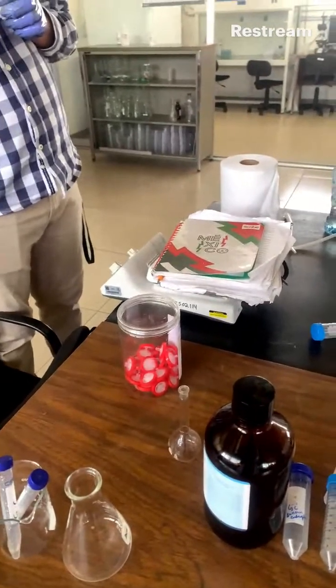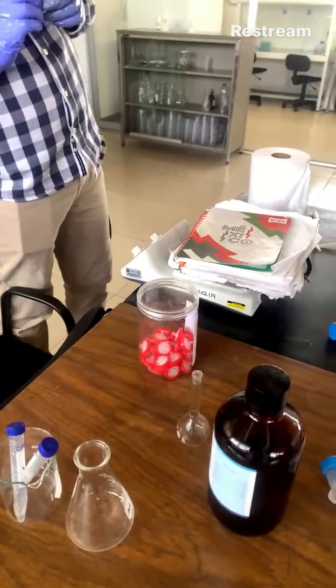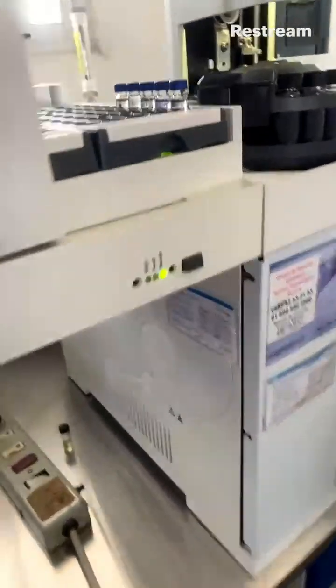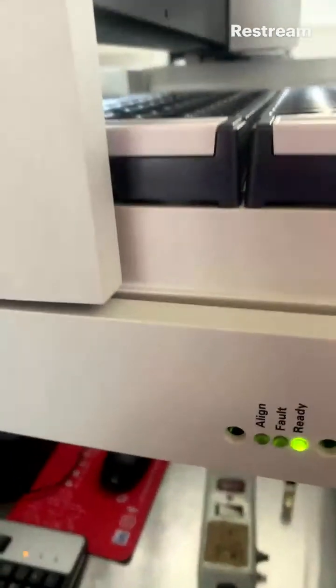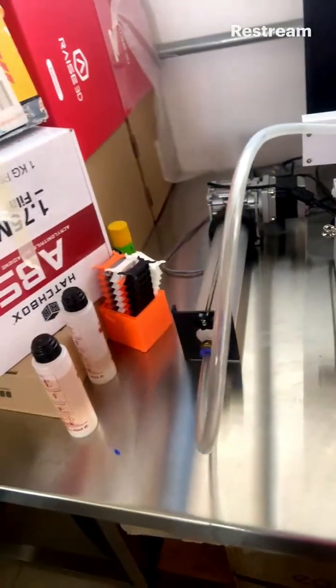So I want to see the yield. So this is also glycerol carbonate, where the catalyst is plantains, bananas. So I'm trying to see their yield using the GC machine. Yes. Oh, it already works in automatic. So it's just to set it up and put it, and then it will work. All right. Good.